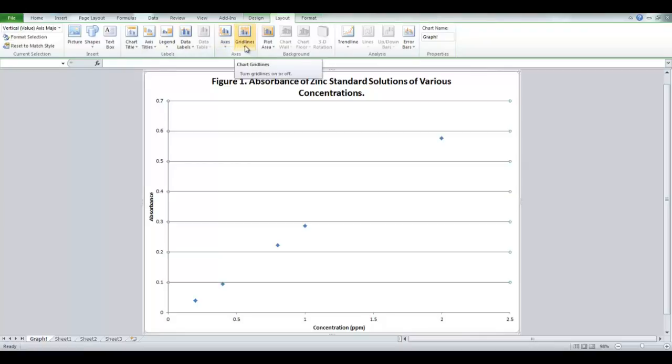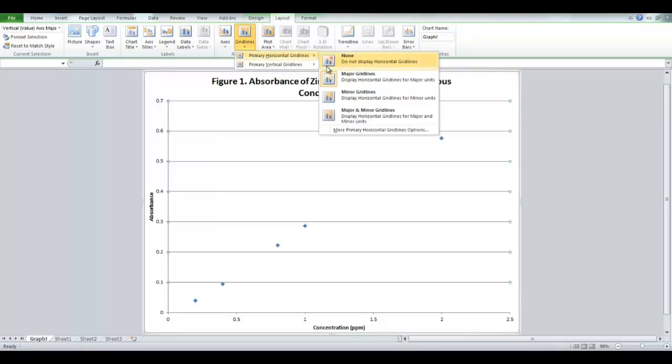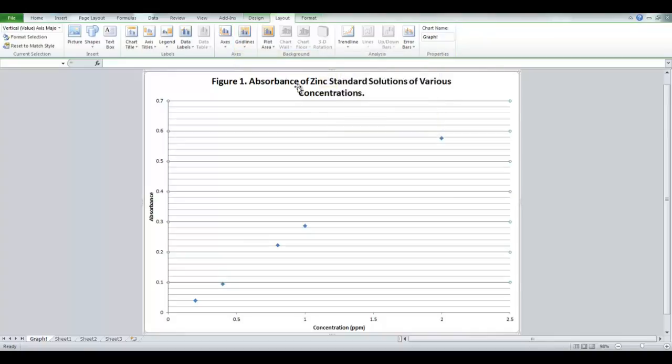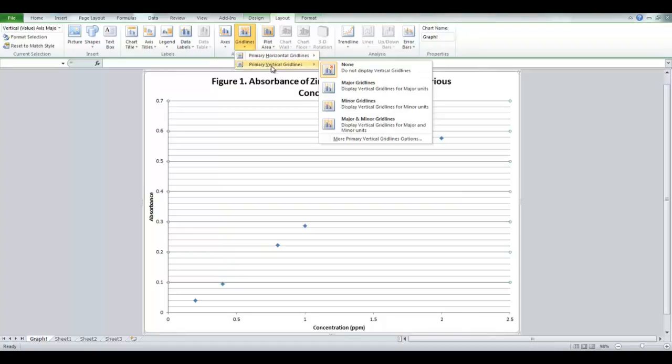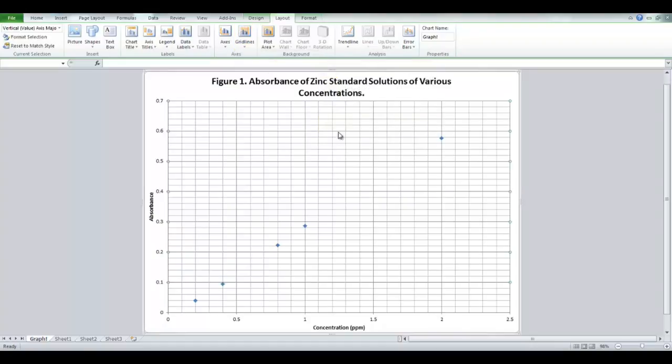So click on it, and again you have horizontal and vertical. And you want major and minor grid lines. For both the horizontal and the vertical. Major and minor grid lines. As you can see, it puts it in there for you.